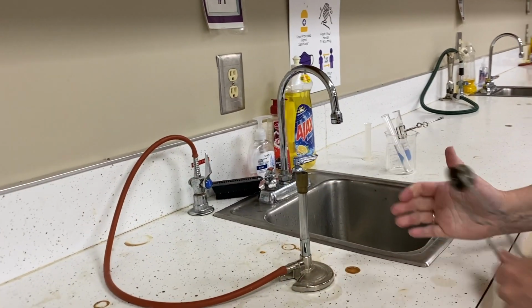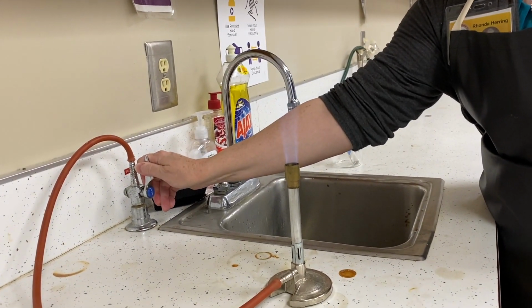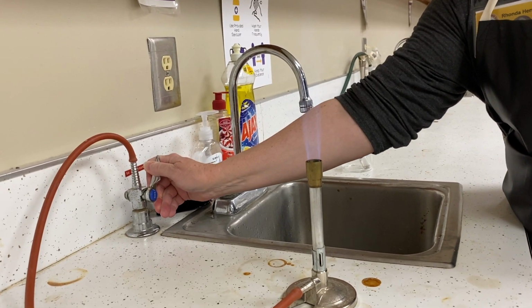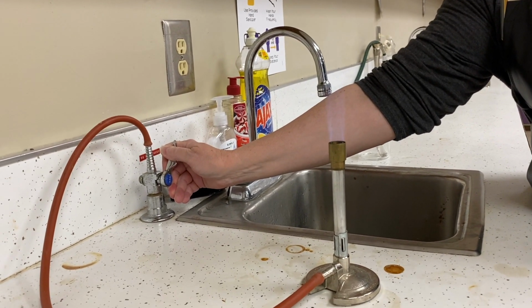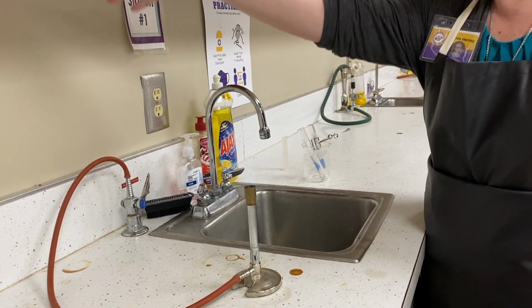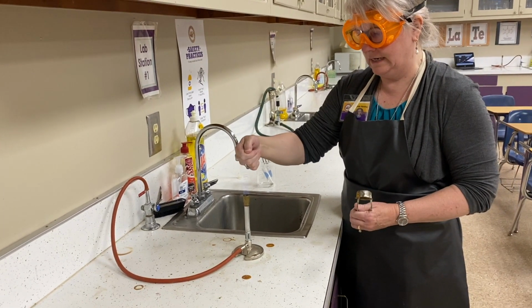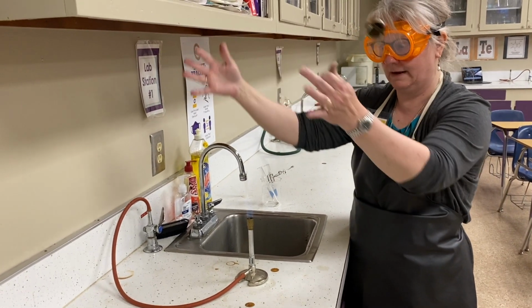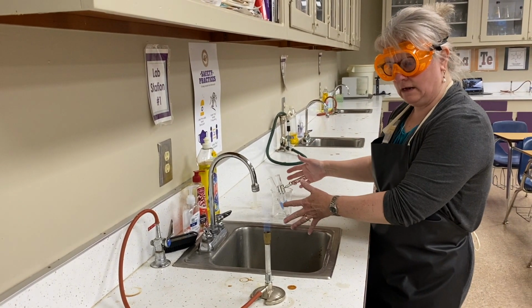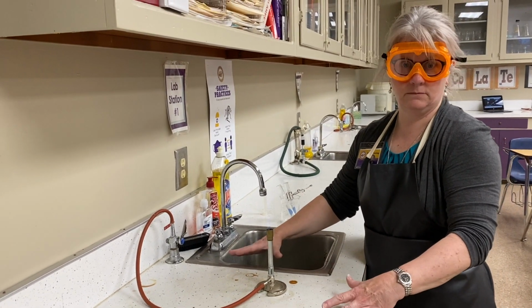light my flame. I want to make sure my flame is not too high. I can kind of still hear it. So again, we just gently ease this back to the 1 o'clock position to bring that flame down. I do not need a huge flame to do this technique. In fact, the heat is really hot up here, and I want to be down in here. So I just want to make sure that everything's very safe. Make sure you keep things that are flammable on this side. There should be nothing around this burner.